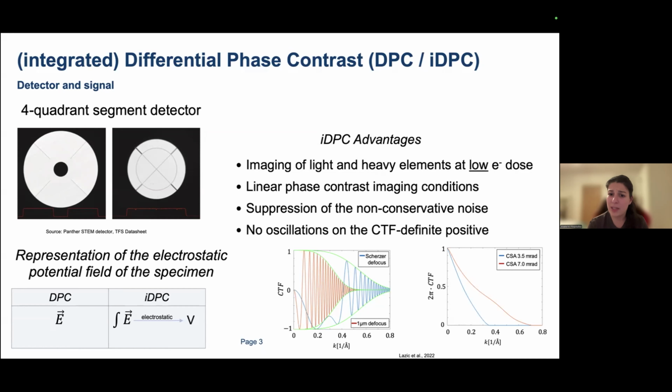But what are the advantages of IDPC and why this approach? With IDPC, we are able to image heavy but also light elements at low electron doses, something really important for structural biology.